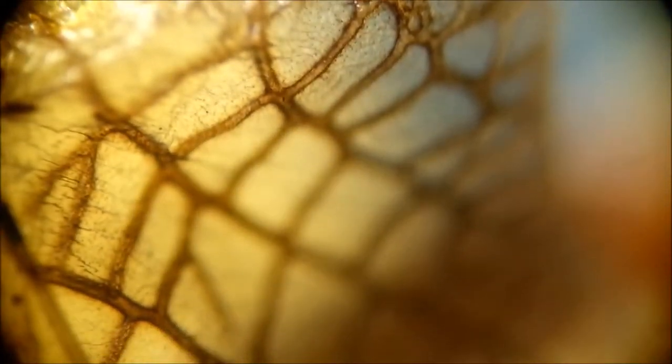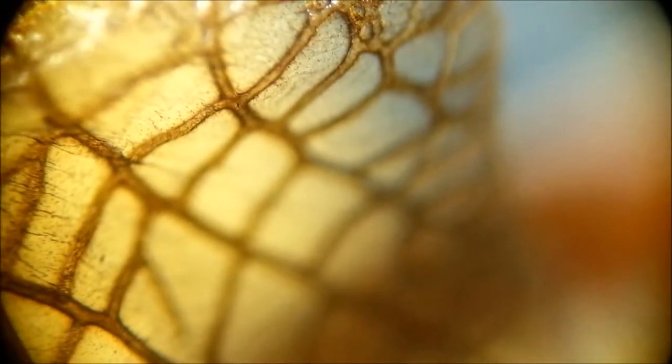So there are two wings. Let's take a look at the cover wings first. The cover wings are a little thicker. These assist more with the steering. Let's see. So all those networks of blood vessels in the wing. Back over to this one, see a little bit more light.